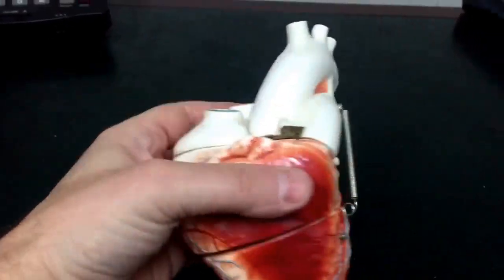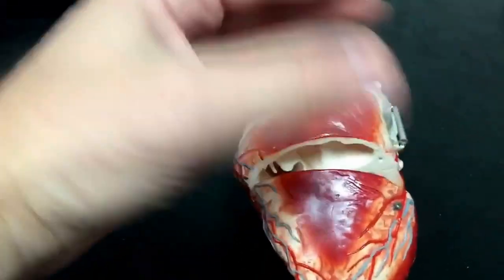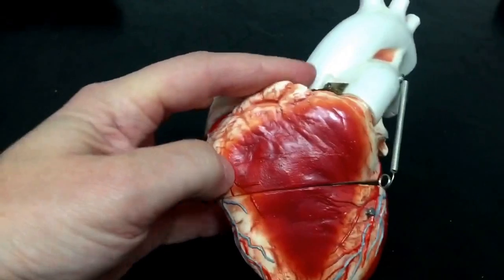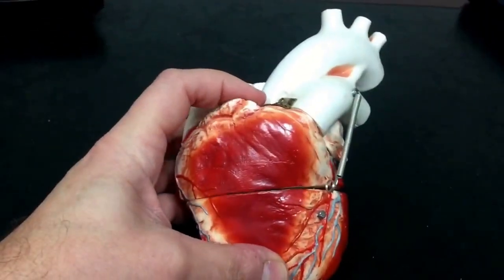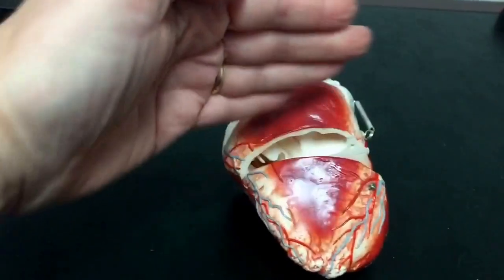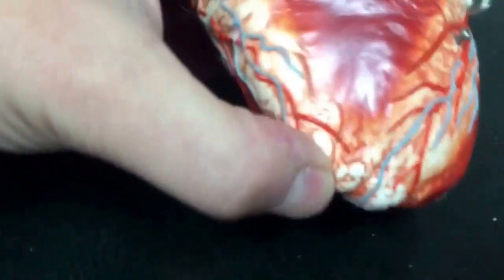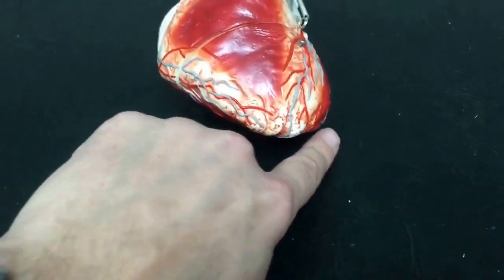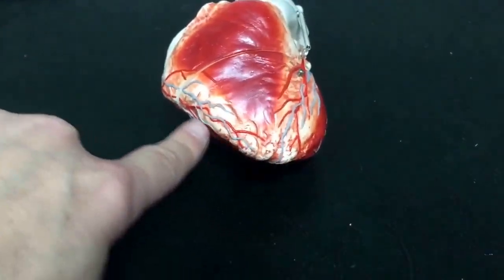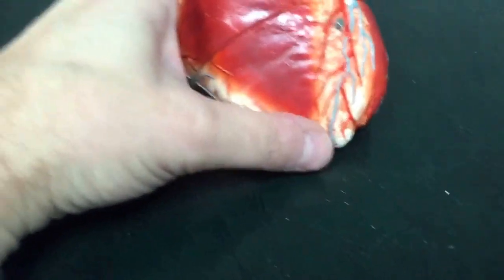normally we don't dissect the heart straight down through what would be called a cross section. If we cut straight down through the middle this way, in this plane, that would be called a horizontal section or a cross section. Perhaps some of you want to do it that way. The traditional way of teaching this, I believe, is to turn the heart up like this and cut upward through the apex and up here in more of a, I guess you would call it, sagittal section.